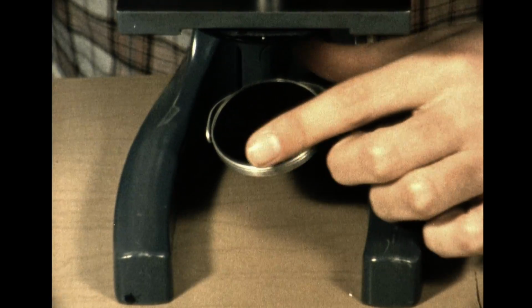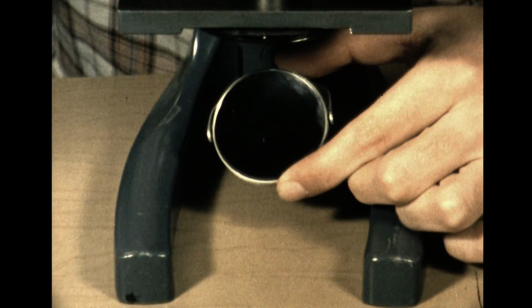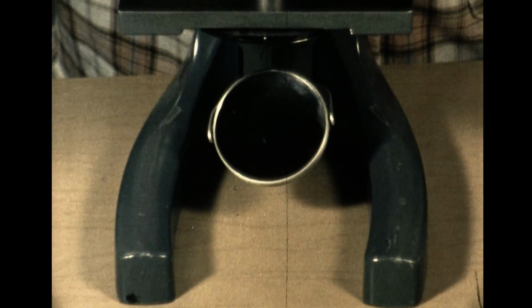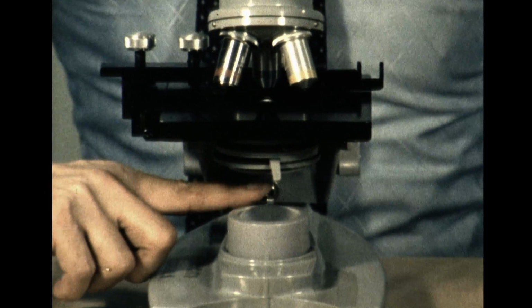The light enters from below. It is reflected by this mirror. Daylight, or light from an artificial source, can be utilized. Warning: never reflect direct sunlight. It may damage your eyes. Some microscopes have their own built-in light source.